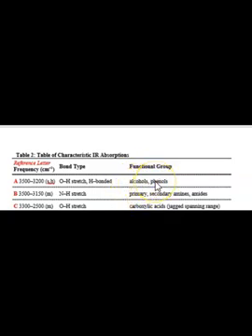Now, phenol is an alcohol. It's an alcohol that has a six-sided benzene ring attached. So amines are very similar to hydroxyl groups or alcohol groups here, right? N and O are right next to each other on the periodic table. And this is also something you would see a little bit different here. You've seen this, primary, secondary, right? Because it has 1 carbon attached to it or 2 carbons attached to it. And then also the amide, that's the functional group that has the nitrogen and carbonyl group.